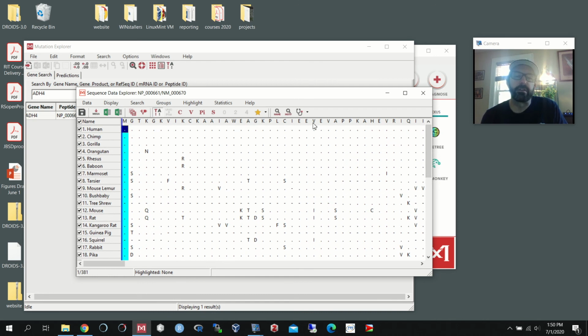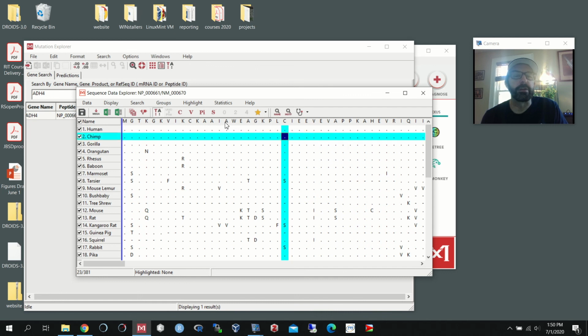One of the things it does is I can go back and make predictions about what happens if I were to alter a particular protein in a particular place here. I can probe that.